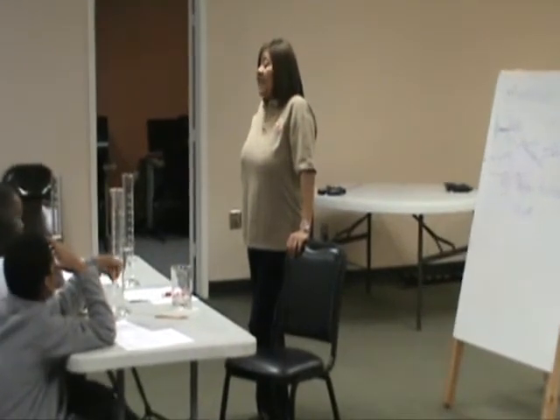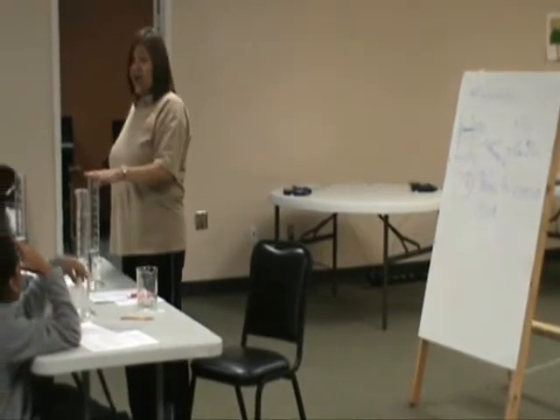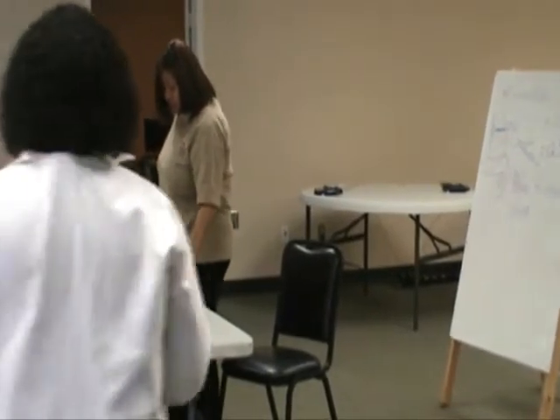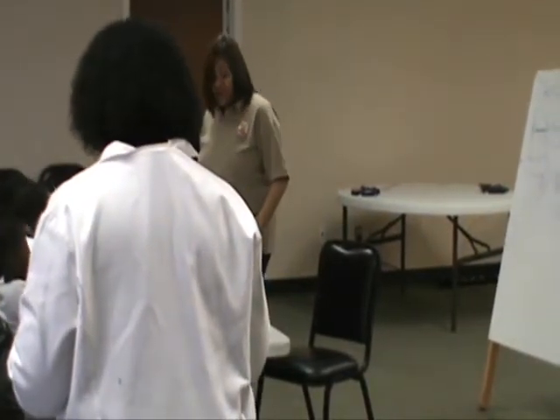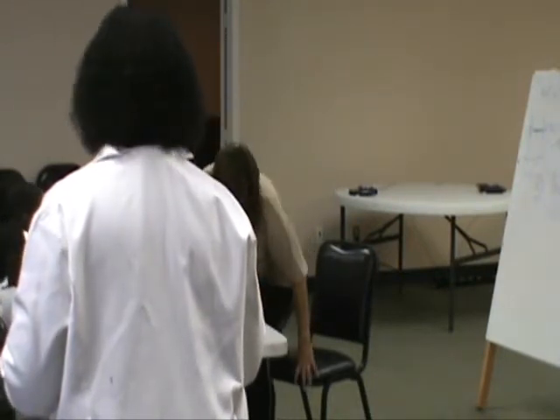What is the maximum volume that your cylinder will hold? 500 milliliters. Excellent. At this time, let's go to our experiment. Take your pencils up very quickly. Here are your pencils. Thank you. And let's look at it now.